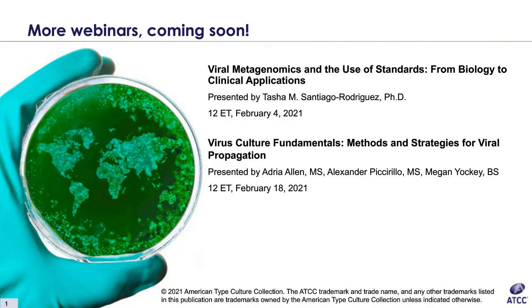Then when you pull it out, that nitrogen rapidly expands, and that causes the exploding vial. So it wasn't necessarily a fault in the vial, more so the vial being too deep inside the liquid nitrogen.